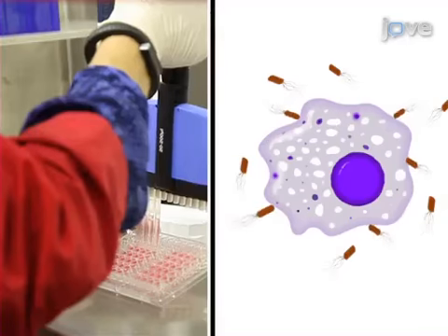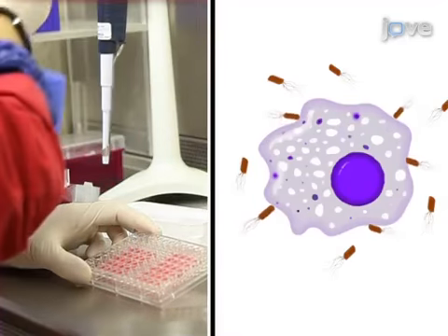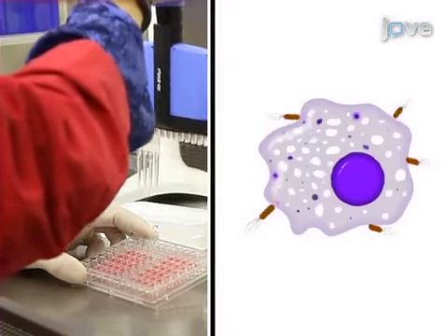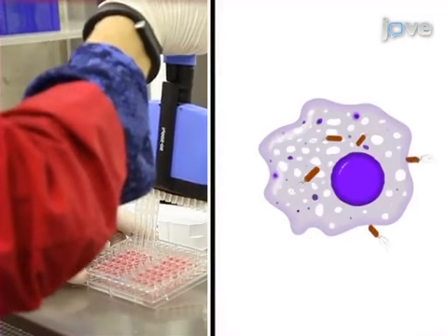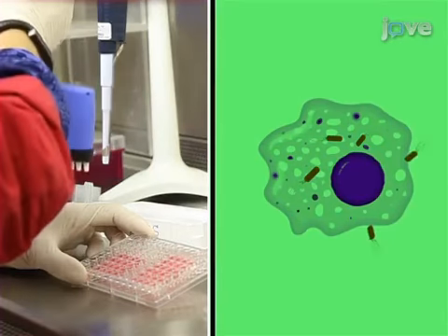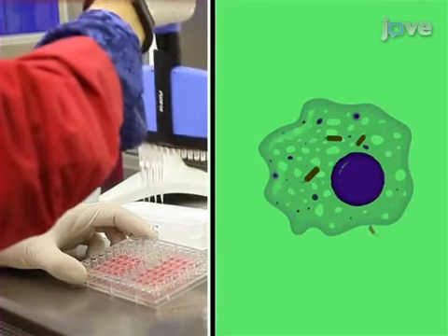As a second step, after the 30-minute incubation, Salmonella that have not attached to the macrophage cells are washed away and fresh medium containing a high concentration of gentamicin antibiotic is added for 1 hour, which kills all the extracellular bacteria that are not internalized.